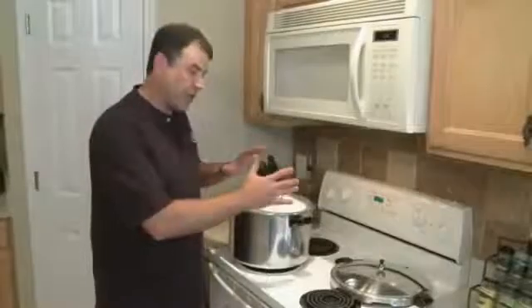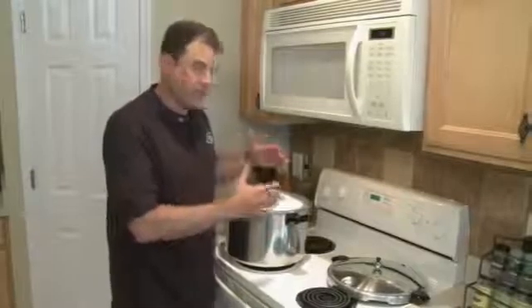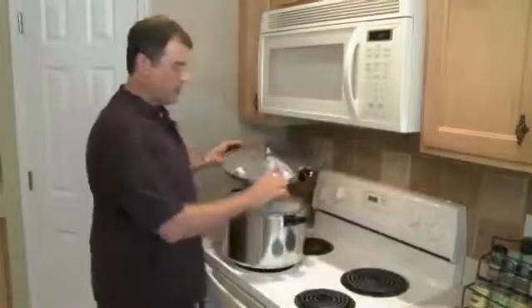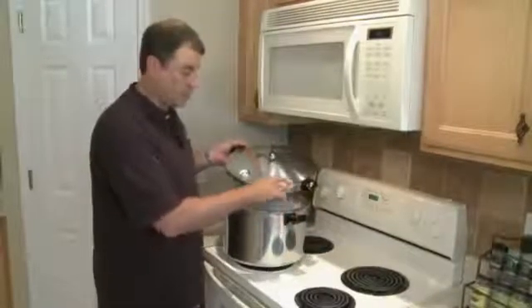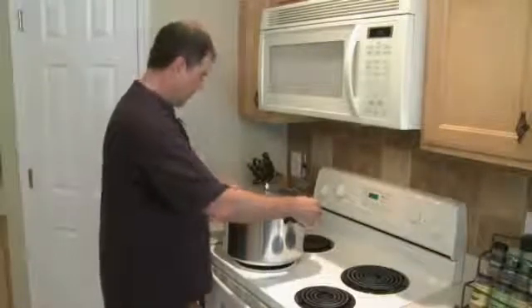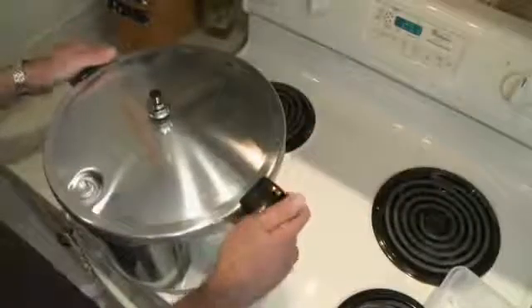One more thing will be how to close this up. If you haven't used a pressure cooker before, it's very simple — it's got a lock-down lid. I'm going to grab the lid here. We have our lid and pot marks, so these are supposed to line up because it's going to lock down. And simply, it locks into place.